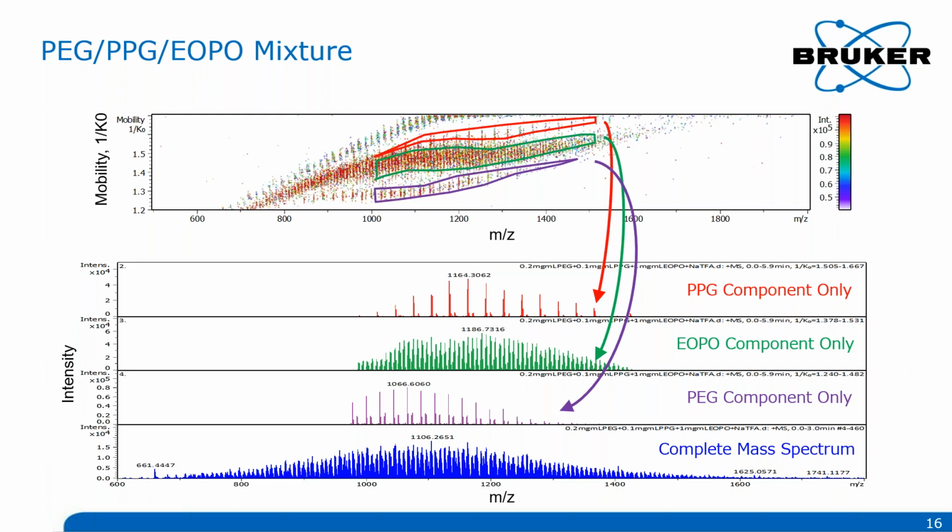Okay, no problem. Can pyrolysis be used with timsTOF for polymer analysis? Yes, absolutely. As I mentioned, there are many different ion sources that can be used interchangeably with this system, including APCI. In particular, there is a very nifty adapter for GC-APCI applications, and that works very well with pyrolysis systems on the front end. In fact, just recently we released a new application note describing a very similar application without TIMS, but with a QTOF instrument. Works very well.